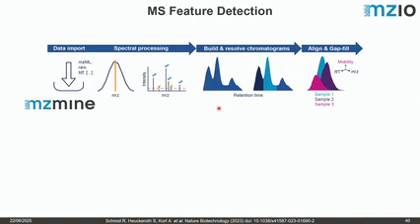So, for example, for usual LCMS data, we would have just a data import. We would do some spectral processing, for example, some centroiding, some thresholding, then build chromatograms and resolve these chromatograms into individual features, and then also align the features across different data sets, across different samples.